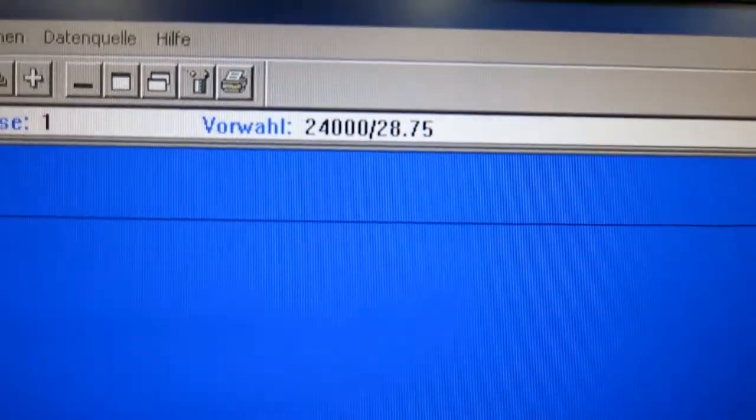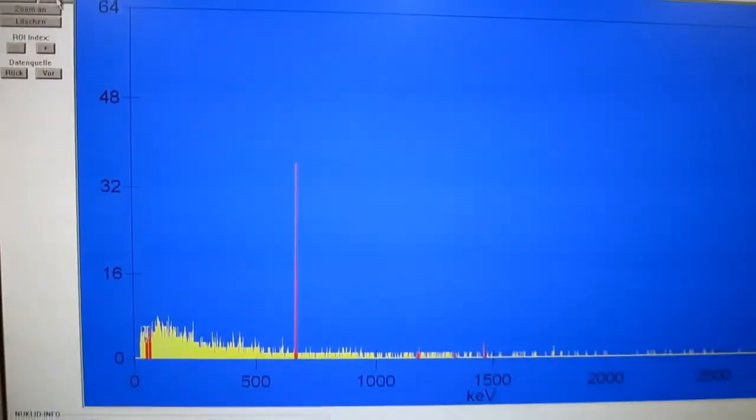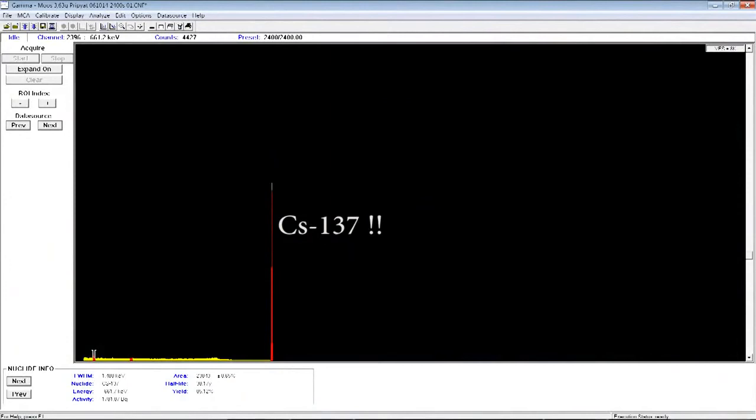The moss just growing next to the tree is not too contaminated, at least the fruit are not, but that moss, wow. But of course I also did that properly, so here's the proper analysis of that moss. You can see the huge cesium-137 peak, and the K40 peak is basically invisible. Maybe 1 pixel if you look right, but it's basically invisible because the activity of cesium-137 is so huge. The activity is 1,781 becquerel just for that small little batch of moss.